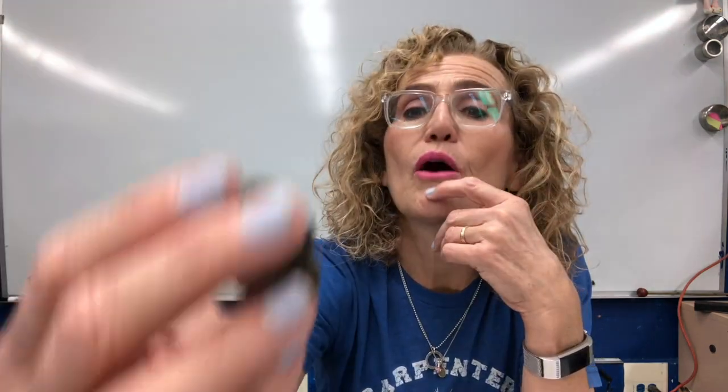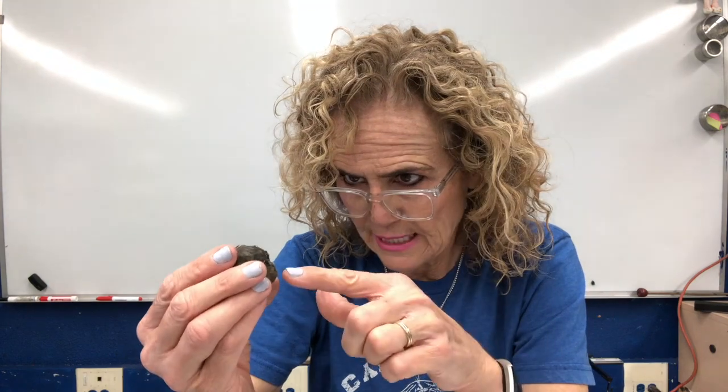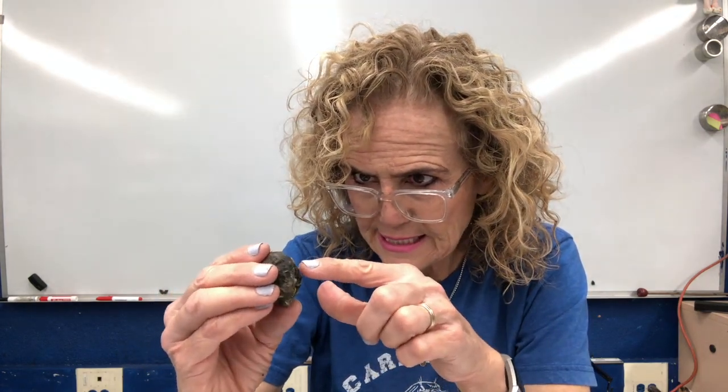Okay, so this is what my pellet looks like before I've done anything to it. I can start seeing already some fur, and I see some little bones sticking out. I got some blue construction paper to put my pellet on. That way the bones and everything stick out so I can see them. Not on black paper, it's not going to show up so well. If you have some blue or green or yellow construction paper, then the bones will show up very well. It'll have a lot of contrast.